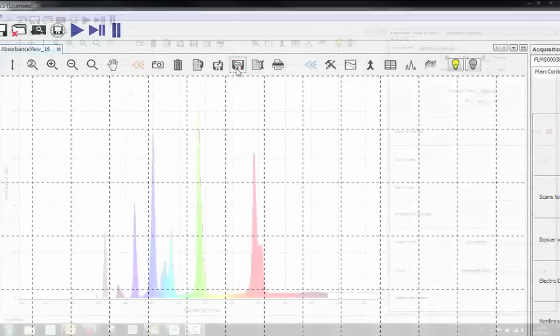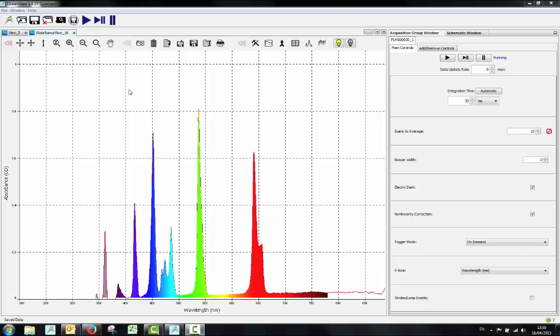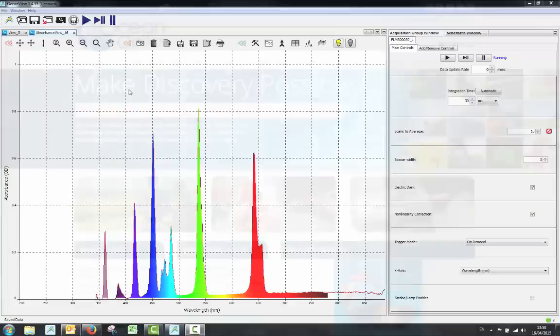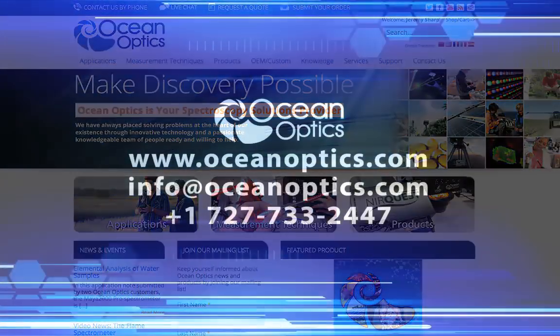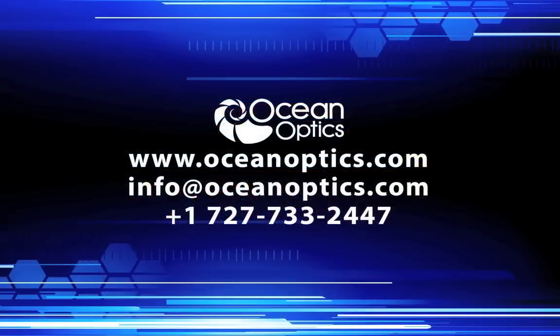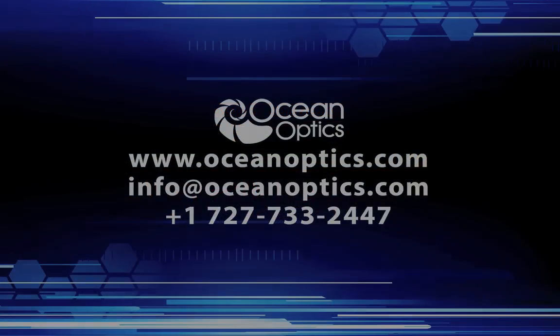So that's how you can do an absorbance measurement, just one of the many types of measurements that can be done using OceanOptics equipment and software. The diversity of applications is limitless. To find out what else you can do using an OceanOptics spectrometer, visit www.oceanoptics.com.